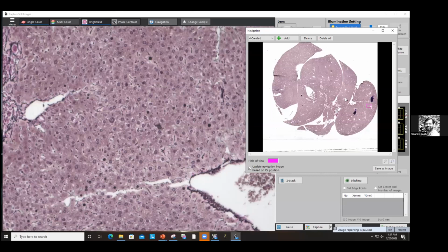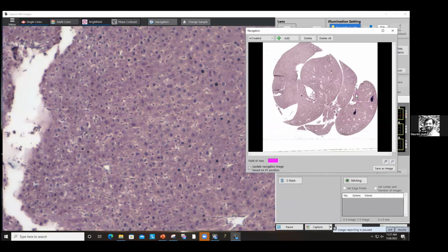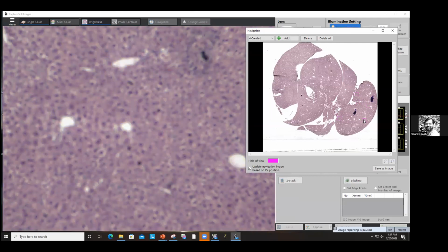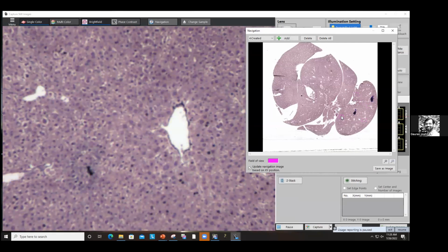All right, so going back, I know that as I move from here all the way to somewhere over here, I'm losing my focus a bit, or we can pick a better region somewhere, let's say, more pronounced here till here. So that's in focus. And as I move more towards left, I'm losing focus. So how do we compensate for this?